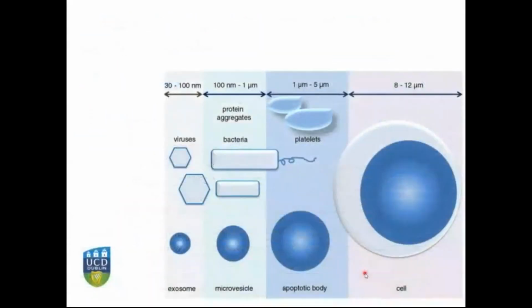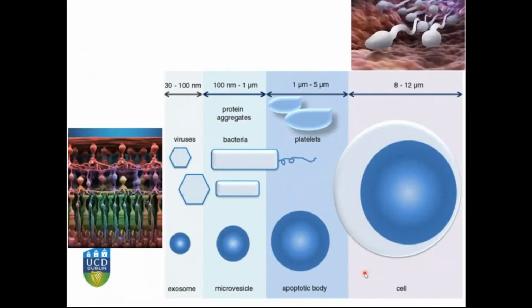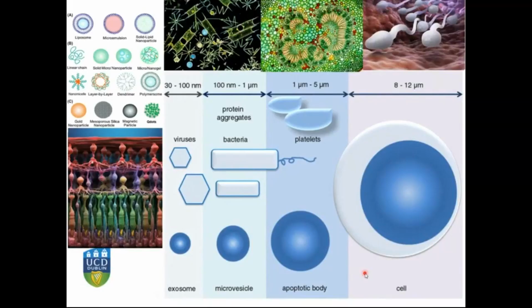Cell types, any kind of cell types, from mammalian cells going to apoptotic bodies, or the area of EVs, coming from cells from tissue or sperm, phytoplankton, or nanoparticles. So what we will do is trying to cover all this range with different applications that the different users that we have in the facility are bringing regularly to the platform.